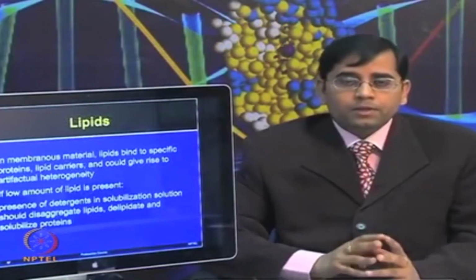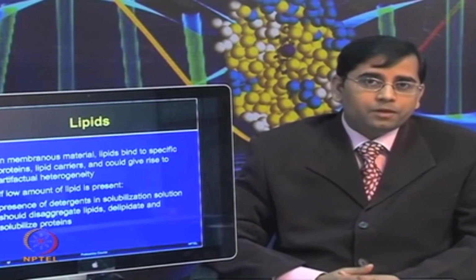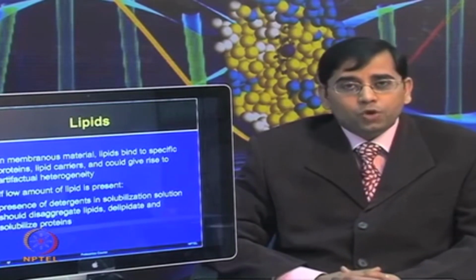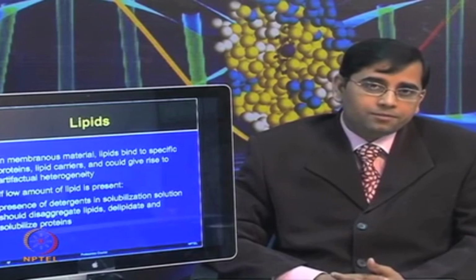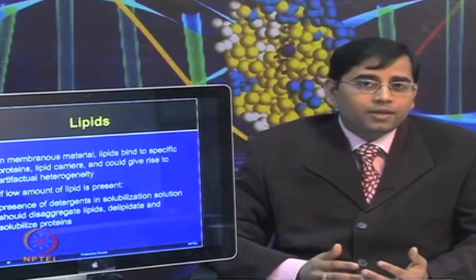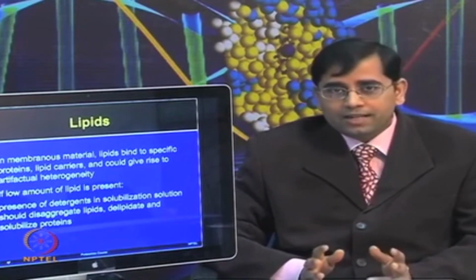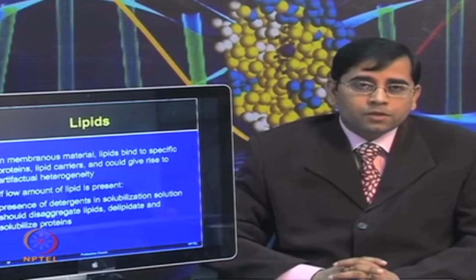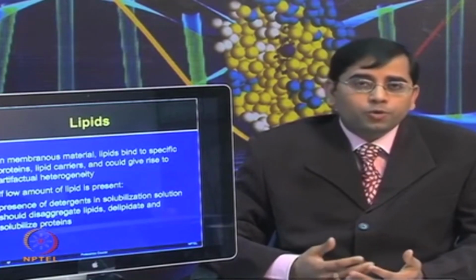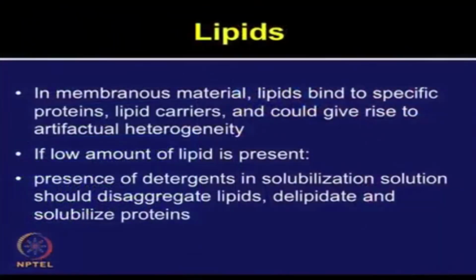Lipids are very important. They are used for various types of biological problems to probe, but if your context is to study proteins, you would like to get rid of any lipids or any other nucleic acid or other interfering components, because you just want to analyze only proteins. Since we are talking about sample preparation for proteins and proteomic applications, you would like to get rid of lipids.